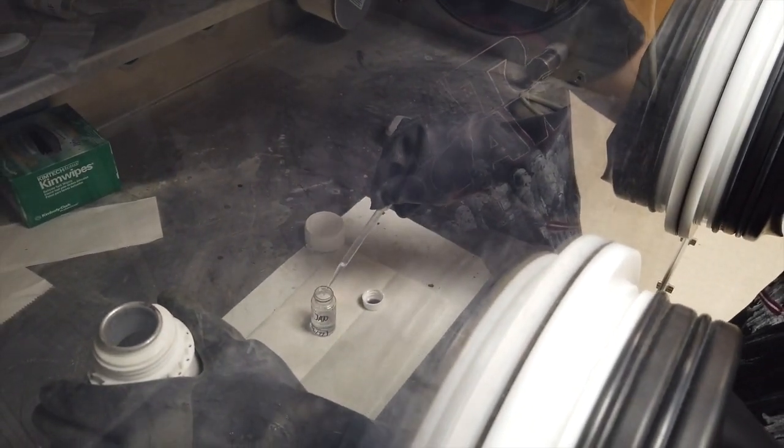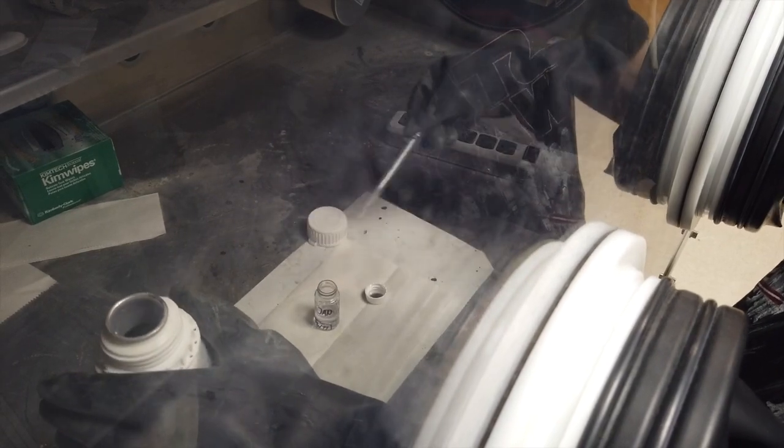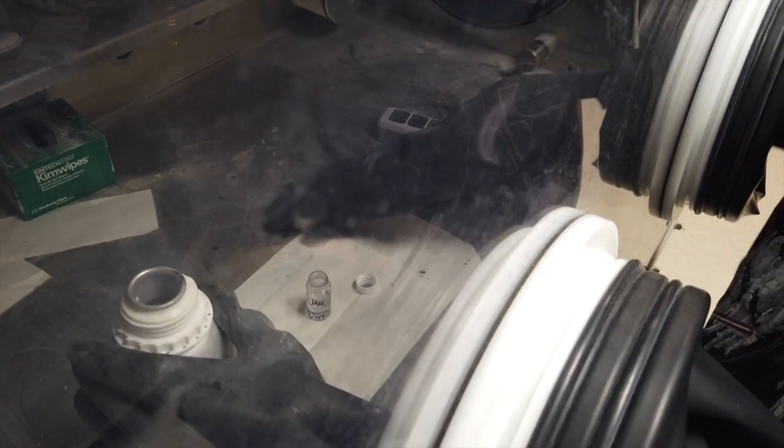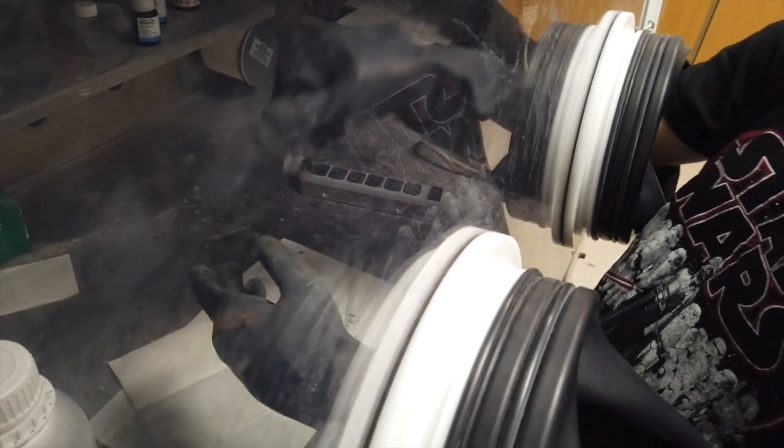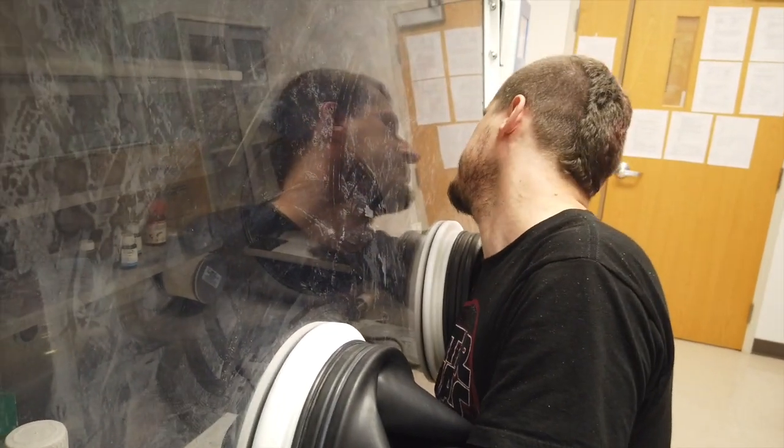So let's check it. I think that's enough material. I think that's okay. Why do I have it? I'm trying to use this for the production of my coatings. I will make droplets on some metal, and it will create polymer coatings, and I will bake it in a normal oven, a little hotter than for baking cookies, something like 600 up to 800 Celsius.